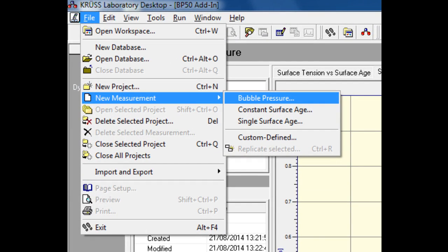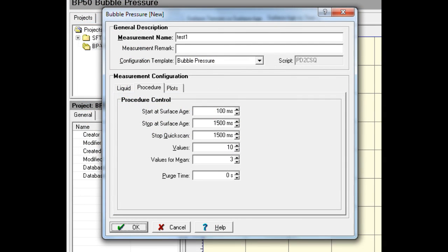We select a new bubble pressure measurement and can then set the range of the experiment in terms of the surface age of the bubbles.